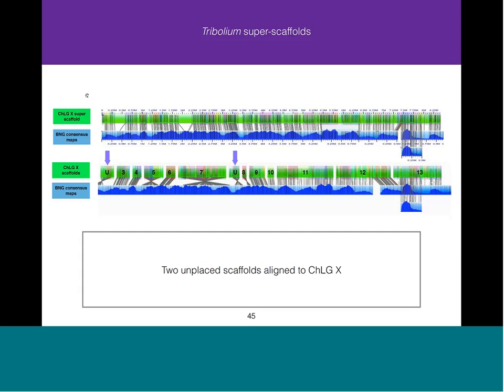So in general, any NGS contig sequence-based data coming in of at least 20 kilobases in length can be in silico digested into a BioNano CMAP. So I would say a contig should be at least 20 kilobases long to even perform the in silico digestion. Practically speaking, during the actual hybrid scaffolding process, we would like to see contigs of at least 100 kilobases in length. This would allow us, on average, 10 labels per contig, and we would have enough confidence then to perform a proper alignment and resolve any spurious alignments.